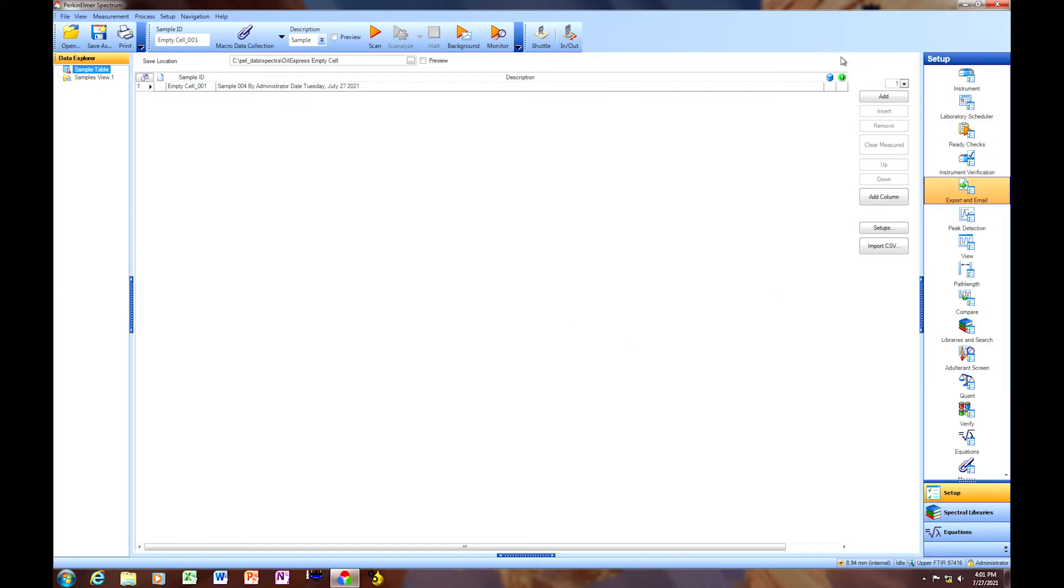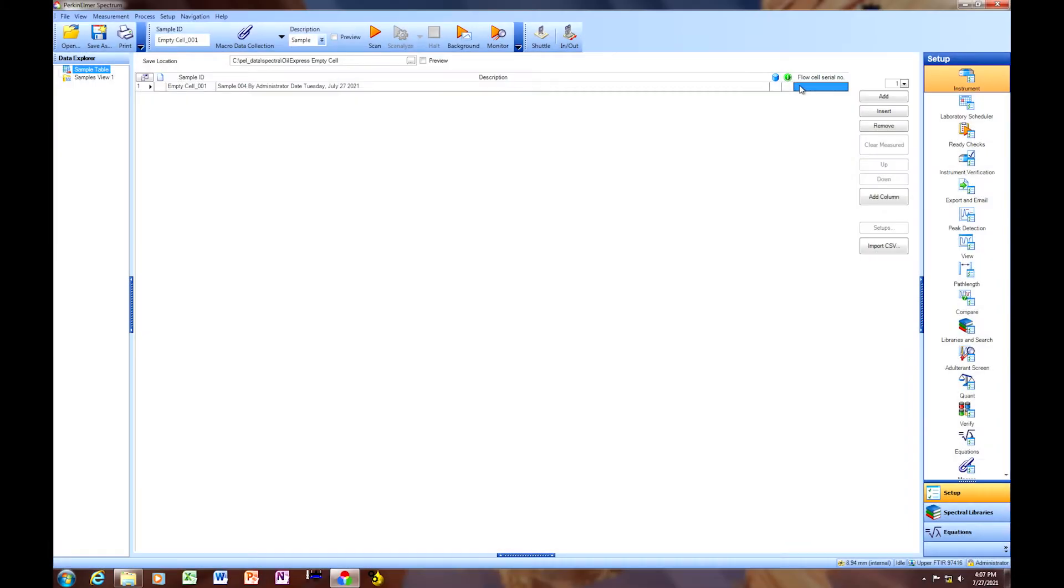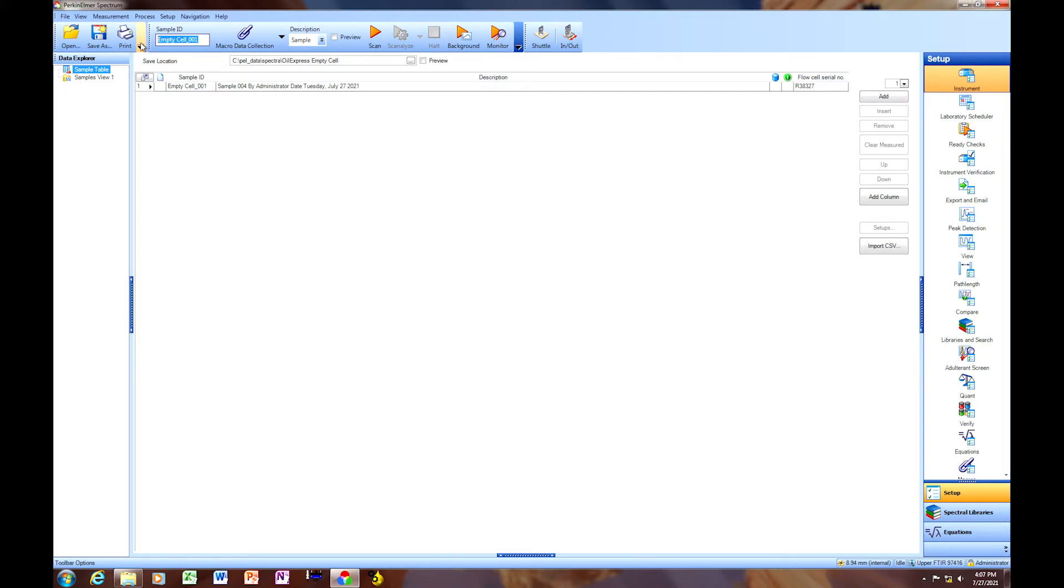Once the utility launches, we have the ability here to enter the empty cell flow, the flow cell serial number. We have our flow cell serial number is R38327. We're going to insert a name for our empty cell reference spectrum. We're going to call it upper, empty, cell reference, abbreviate, and the date for easy recognition later.